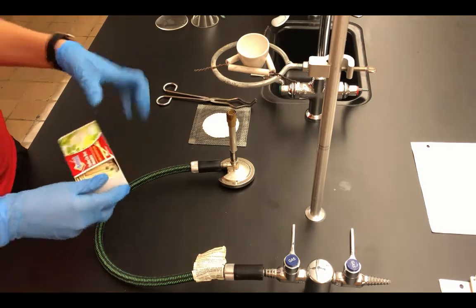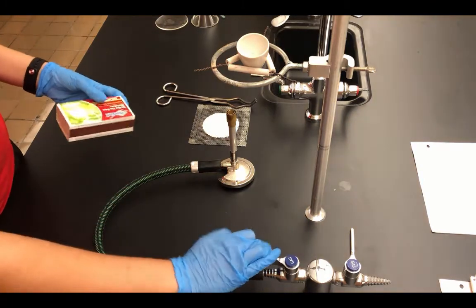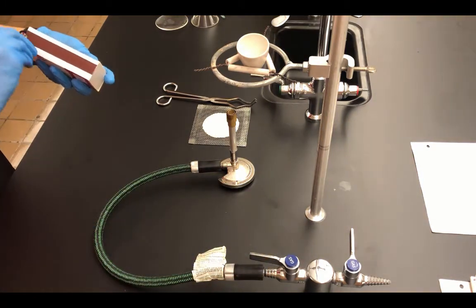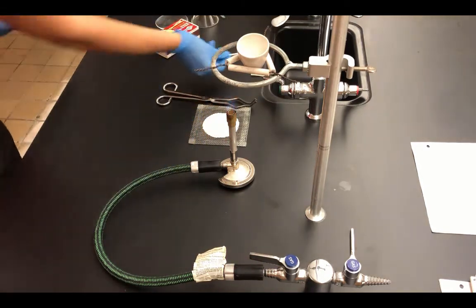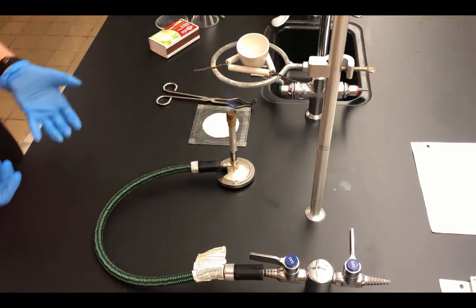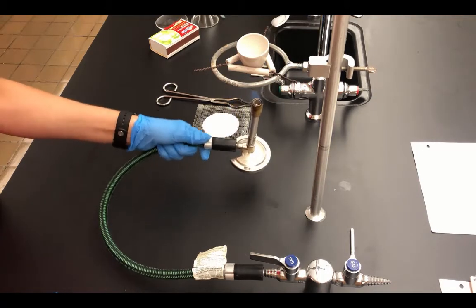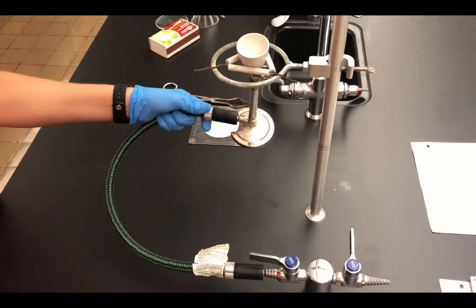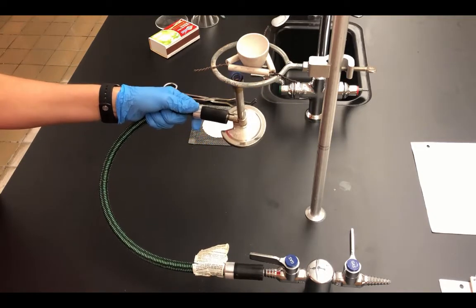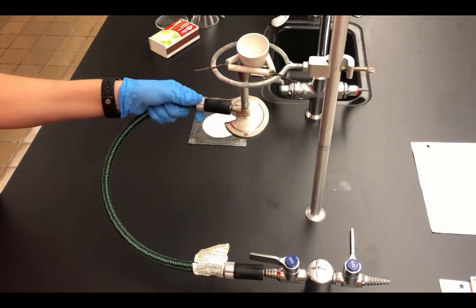And so I'm going to light the Bunsen burner as before. I'm going to turn the gas on, take the match, and light the Bunsen burner. Now once the Bunsen burner is lit, it says that you're going to brush the bottom of the crucible with the flame for 2 to 3 minutes. As I brush the bottom of the crucible, I want to go back and forth. I don't want to hold it in the same spot.